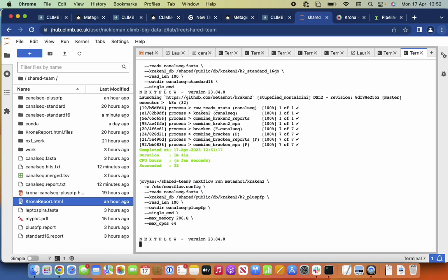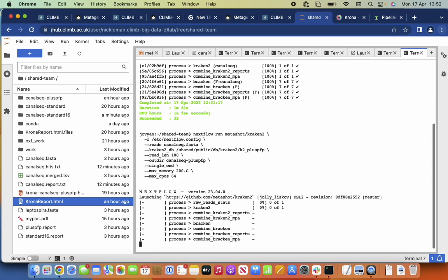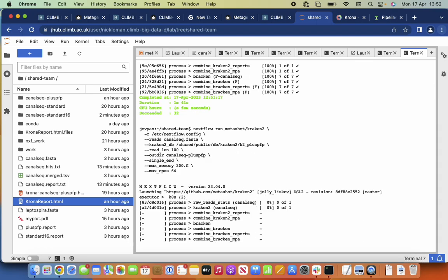So is that resource then protected while the job's running? You're kind of sharing it at this point, though. So if everyone goes in and does it all at the same time, you're going to wait for a slot to become available. No, there's a big pool of CPUs and RAM, and you're just asking for a slice of it for the duration of the job.